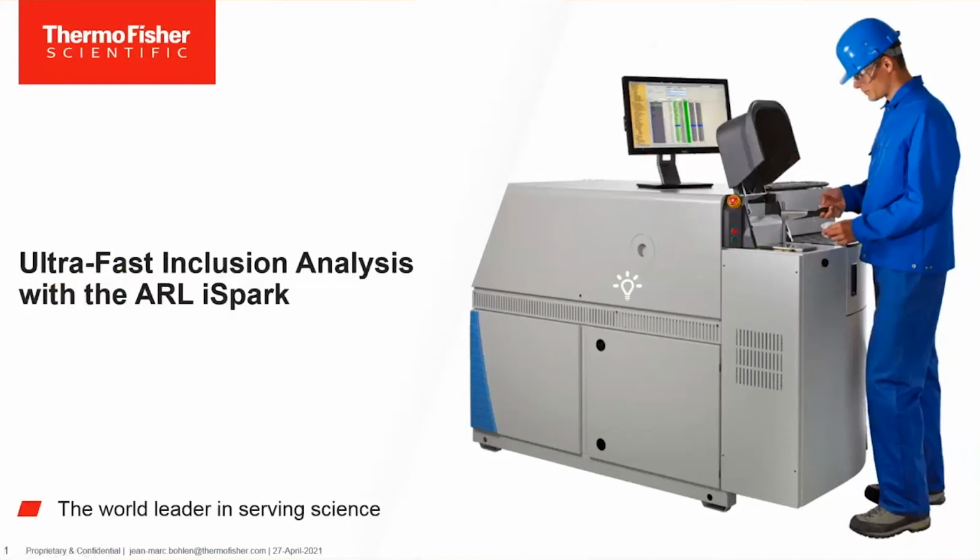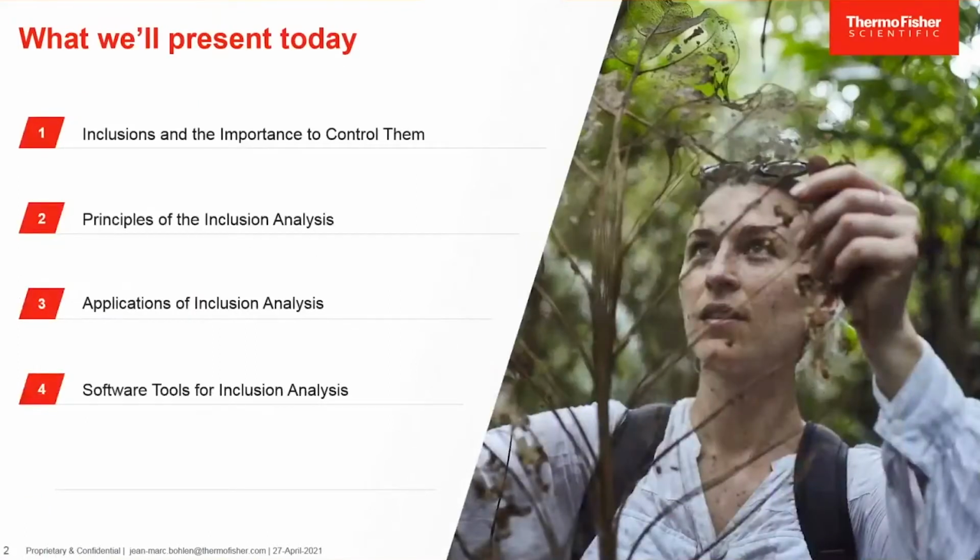This presentation is about ultra-fast inclusion analysis with the ARL iSpark, a Spark OES spectrometer. Today I will start the presentation with the inclusions and the importance to control them. And then I will continue with the principle of this inclusion analysis with the ARL iSpark, followed by some examples of application of inclusion analysis with the ARL iSpark. And finally, I will present you the latest software tool for inclusion analysis.